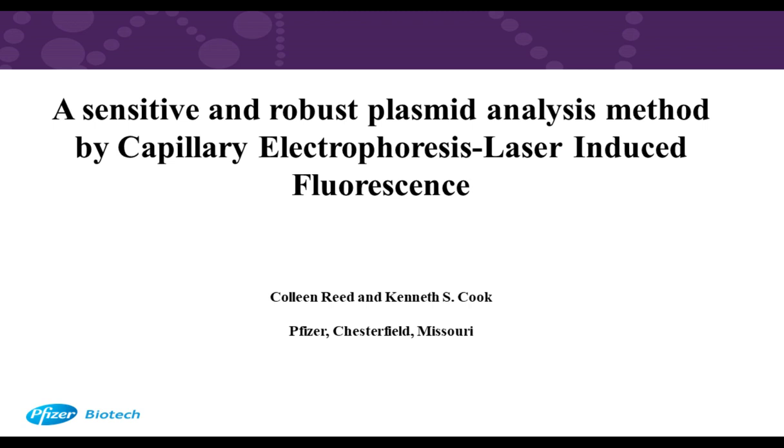In addition to agarose gel, capillary electrophoresis, and HPLC, did you try any other technique? If yes, how does that technique compare to the agarose gel, CE, and HPLC? So yes, we have also run AUC, and the pre-stained agarose gel, the AUC and the CE method tend to align on both the supercoil and the open circle. The HPLC is really the outlier.